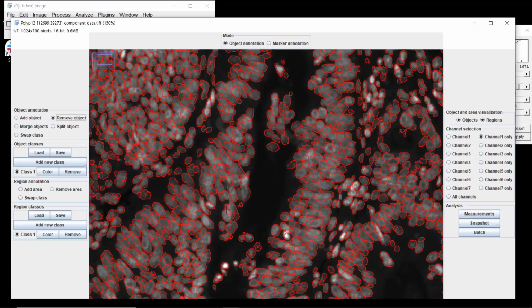Here it's not the best one, clearly. This is clearly wrong. And then you can just keep going like this. But again, this is hard, even by eye. And so you can improve like this.